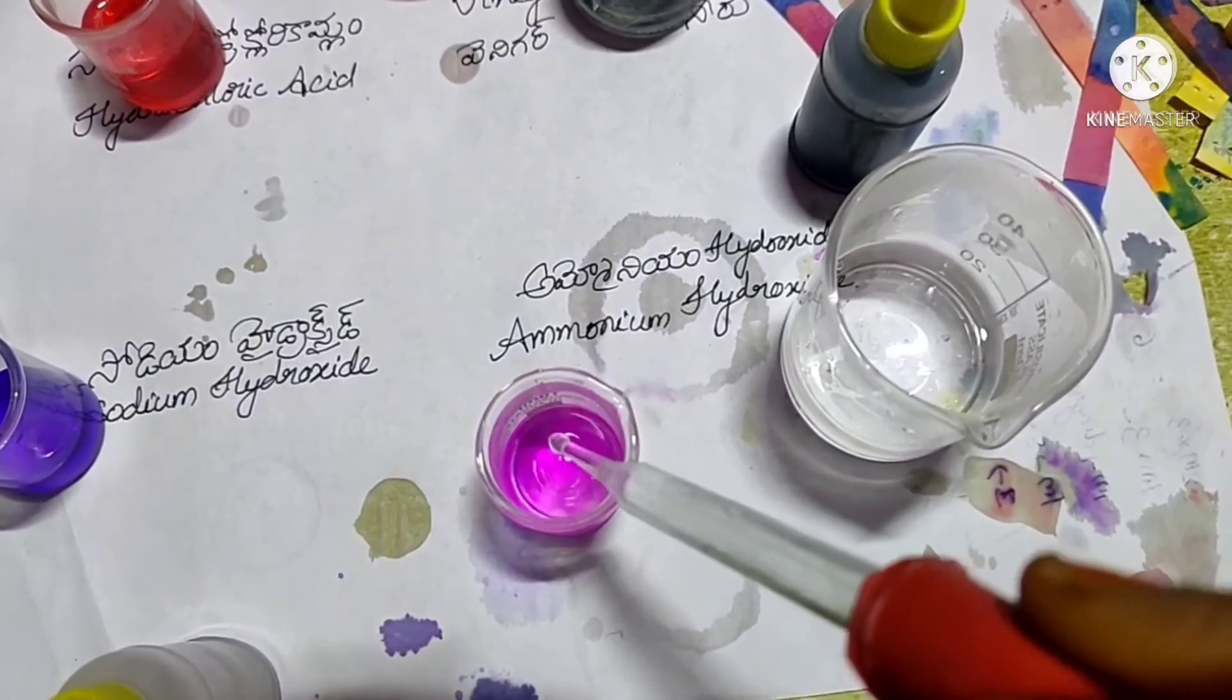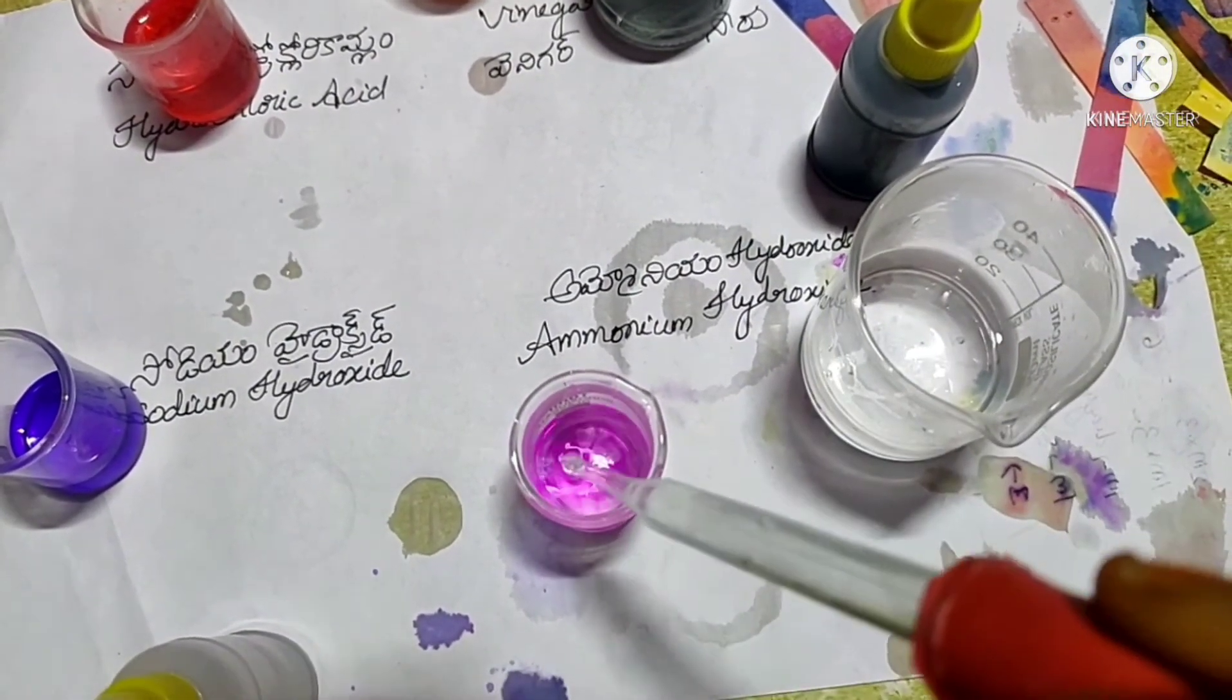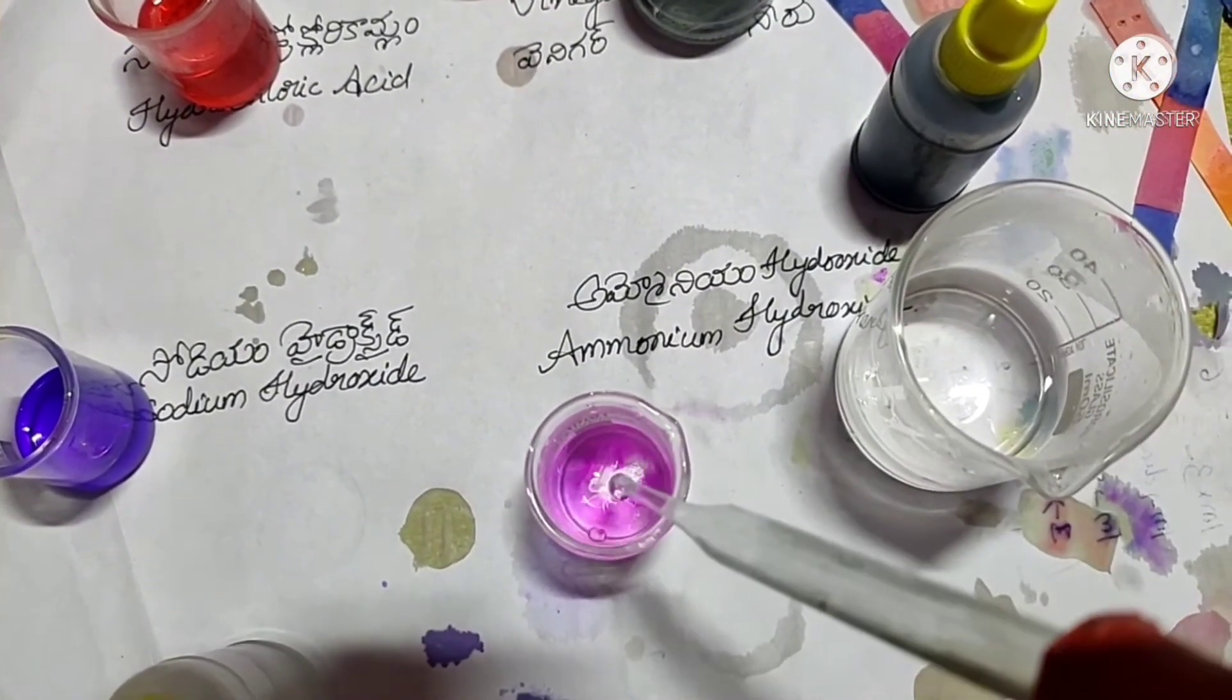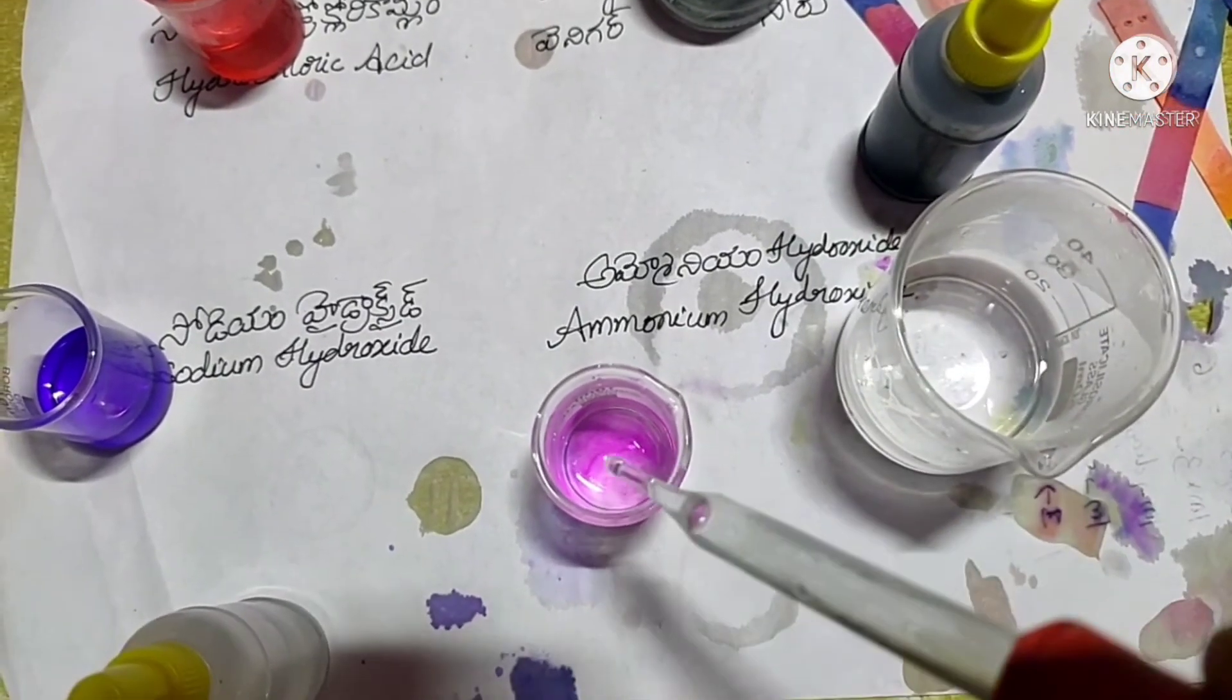When the pink color disappeared, it indicates neutralization by the acid. We know that the color of the phenolphthalein indicator is pink in bases and colorless in acid solutions and neutral substances.